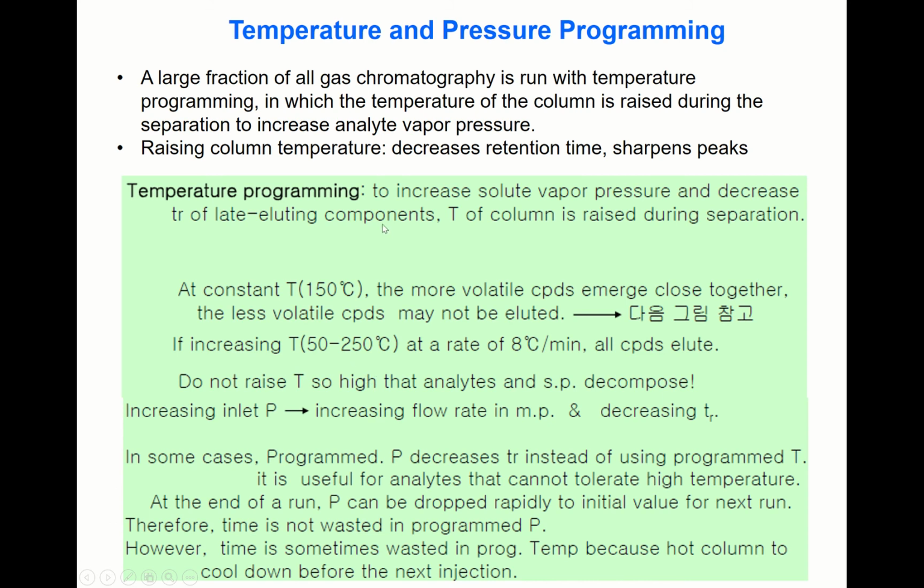The next topic is temperature and pressure programming. Usually while you're running gas chromatography, you program the temperature. Sometimes you may also program the pressure, but pressure programming is not often done. Temperature programming is very usual practice. You program the temperature of the injection port and the column, and sometimes the detector part.